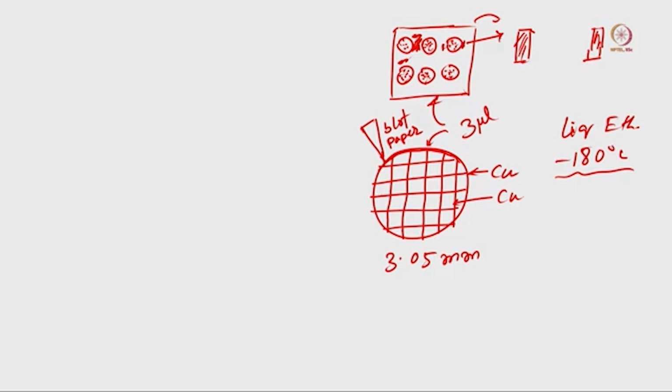The amorphous ice may have a different shape, it can form this kind of shape, or this kind of shape, or some other shape is also possible, where our protein molecules will be embedded at different orientations. So basically we are trying to image with an electron beam that passes through this sample and gives us a 2D image of a 3D object.